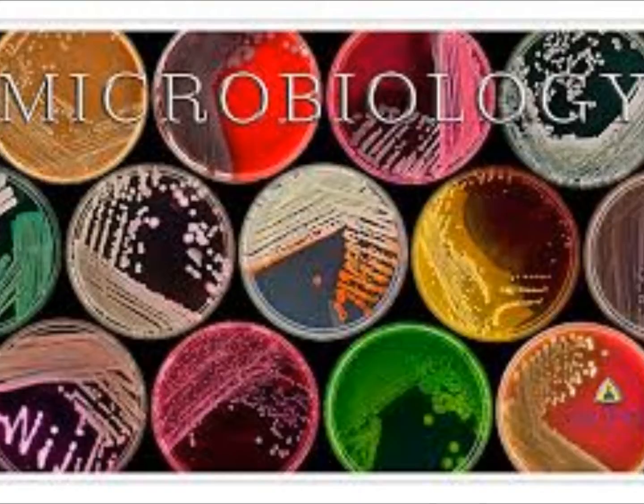You put a drop of water on that slide, you pick up one colony, unless you've got a really tiny one, like the Candida glabrata. You're probably going to have to pick up a few colonies because they're very tiny. Do I throw it out? Do I do a new one? Did you touch the slide? Yeah, I would throw it out.